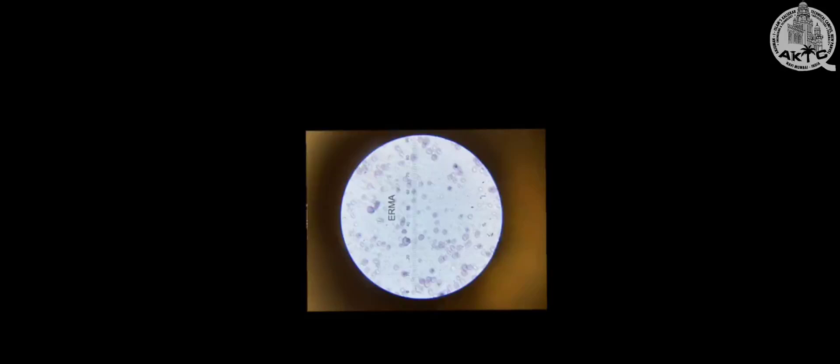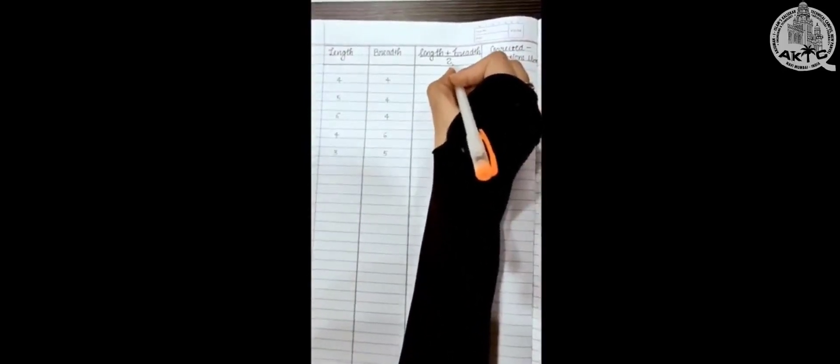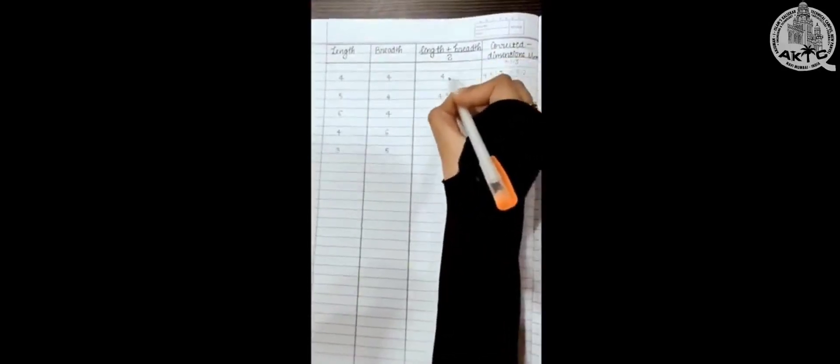So here we again get four lines. After taking the readings of length and breadth, we have to take its average, that is length plus breadth divided by 2. So here we got length as 4 and breadth as 4, so length plus breadth divided by 2 will be 4.